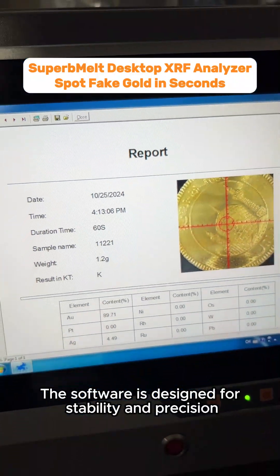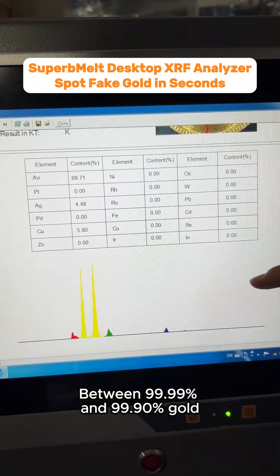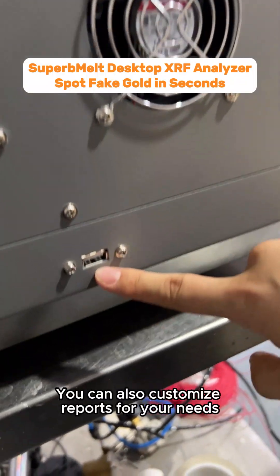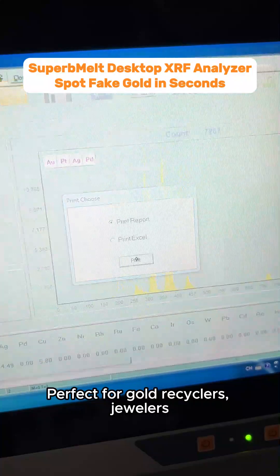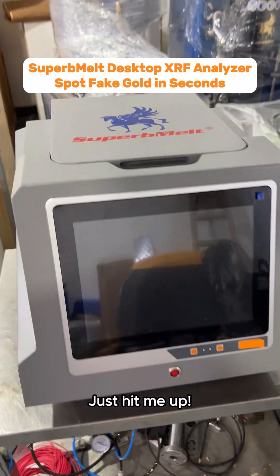The software is designed for stability and precision, even telling the difference between 99.99% and 99.9% gold. You can also customize reports for your needs. Perfect for gold recyclers, jewelers, pawn shops, and more. Need one? Just hit me up.